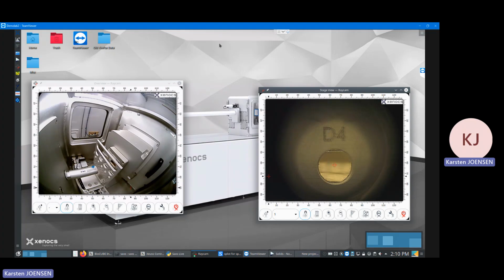Now, what we have here is the demo lab system in the US, where we have put in a standard sample plate with the atmospheric caps. There are two parts to that. On the left-hand side, there's a tube, and at the end of it has a see-through Kapton window. On the detector side, there's a section with a larger window, and then a mechanical fixture to ensure that the vacuum on the detector side is not breached. Going into that and setting that up is a different discussion.